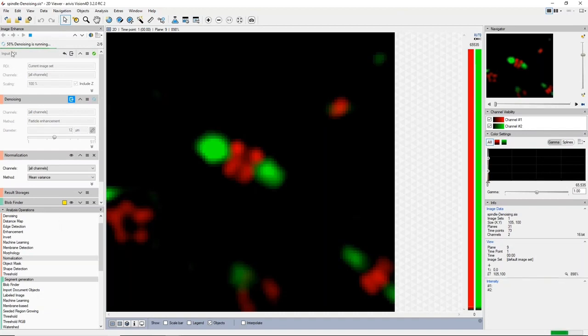Another nice thing, we've made it a lot easier to see right at the top of the pipeline the current rate of progress. It was one of those things that drove me crazy with the other version, that we had it in white font on a grayed out title bar, and it made it really difficult to see the rate of progress.